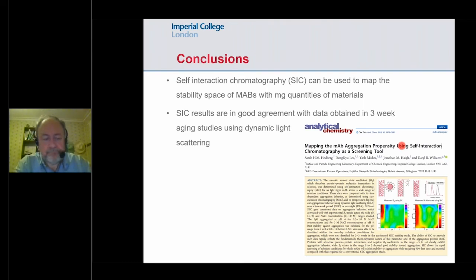Okay, thank you. The next one is, are the proteins acting in the stationary phase and the mobile phase in the same conformation? If so, then how can you ensure this?